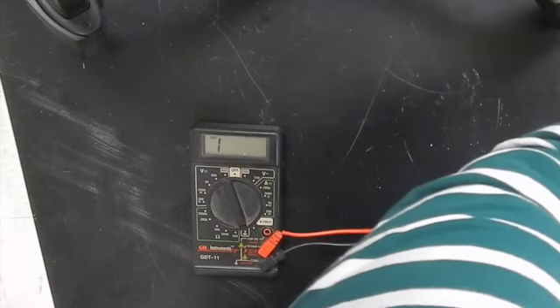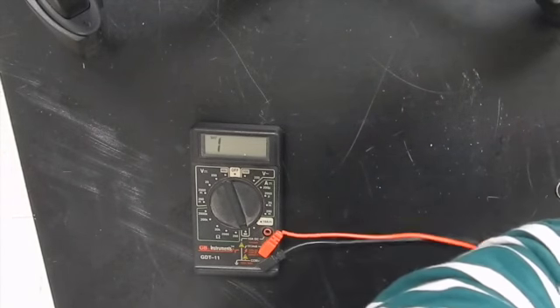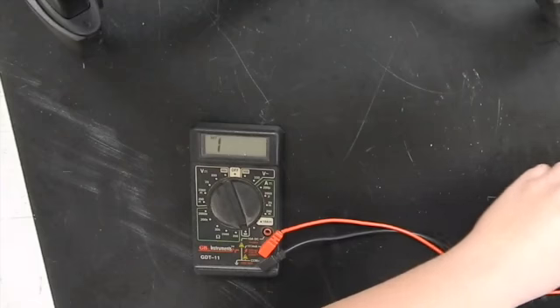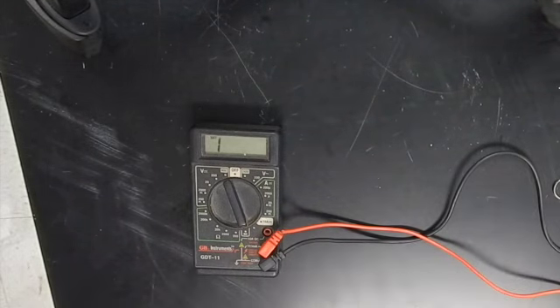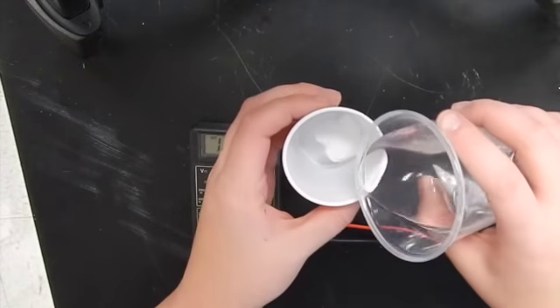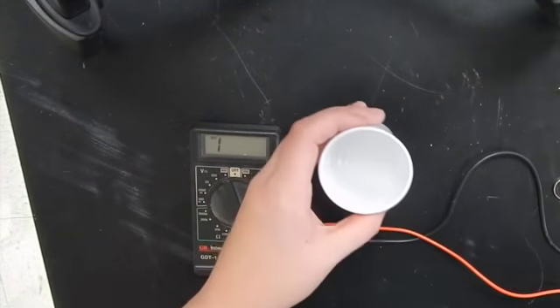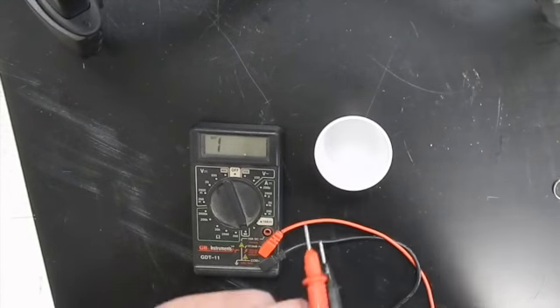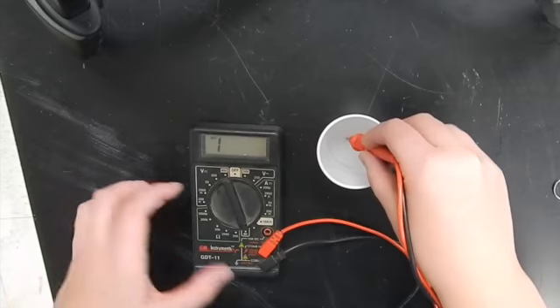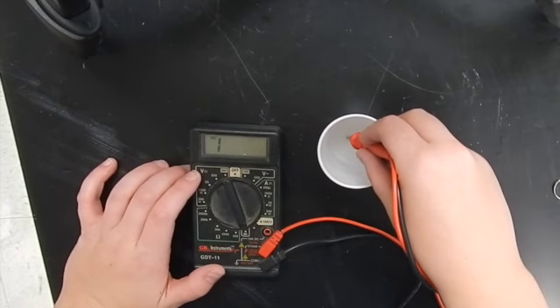Go ahead and rinse this off. And now I'm going to put sugar in the cup. Mix it with a little bit of water. And do the same thing. You notice that the number doesn't change at all.